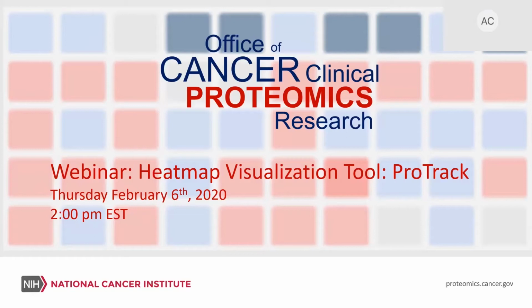Today we will be discussing a heat map visualization tool from the CPTAC program called Protrack. This webinar is hosted by Biomedical Software Engineer Anna Calinawan of the Icahn School of Medicine at Mount Sinai, New York, and Dr. Pei Wang's lab.